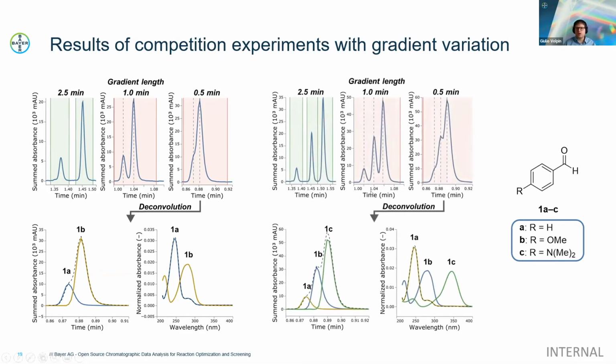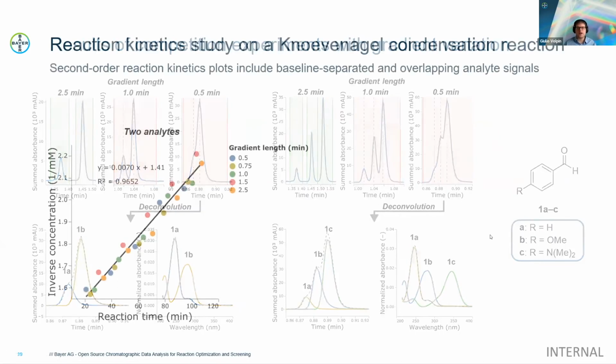And we can also do this with the same type of reaction, now with the 3 component, where the spectra get more and more complex. And we've done extensive benchmarking also with simulated types of peaks, retention times, and UV spectra. And with this, we were confident enough to say, okay, let's test this. Let's see how this looks.